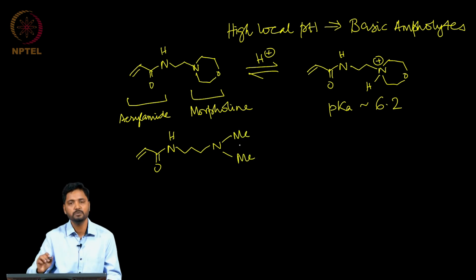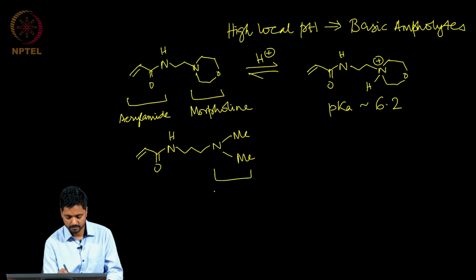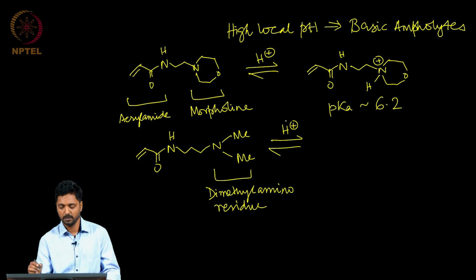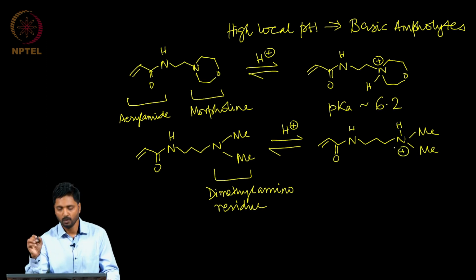Now, when we use this dimethylamino residue we again create a high local pH because of its basic nature and formation of this protonated structure in presence of water.